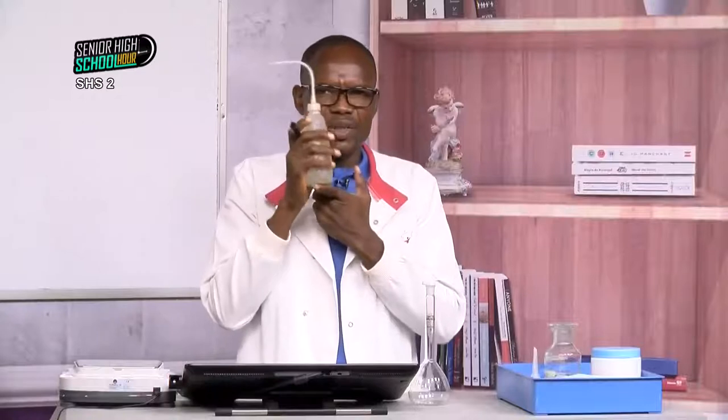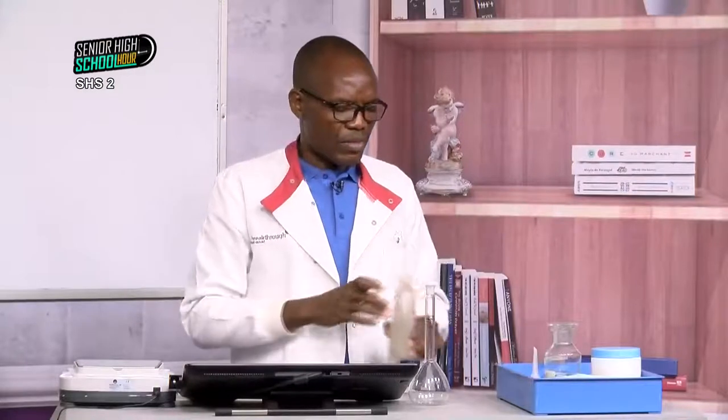Solid, yes, I must dissolve the solid. So what do I need? I need water. Now, of course, distilled water, so that impurities in the water will not interfere with anything. What at all am I going to use to prepare the solution? Oh, I need a solid substance. But here I have sodium carbonate.